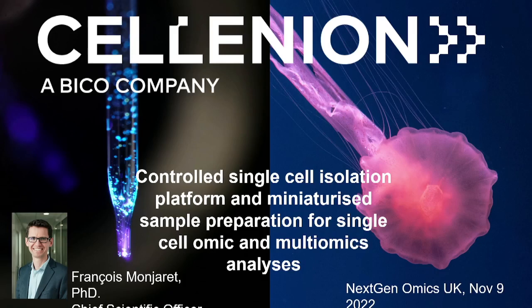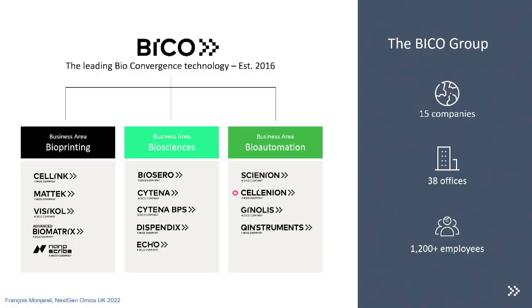Any question, guys? Can I maybe ask which sample type you use to perform the single-cell transcriptomics experiments? Single-cell transcriptomics, yes. 3' RNA sequencing. Yes, you showed some data, but you did not really provide which type of sample. So that was HEK cells because we wanted to compare on public data sets. But we use this kit on any kind of sample, skin, cancer, yeah, cells from the blood, anything.